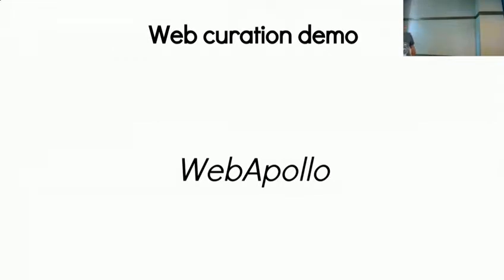But this is a great segue, and I love having someone else explain the problems of automated curation or automated annotation. This is a different organism, but the screen should look very similar to what you just looked at. We are viewing a JBrowse view of this sample organism called Volvox, but that doesn't matter. Next year we hope you'll be presenting with Apollo or something within Galaxy. You click on the view, and it takes you into this alternate product here.